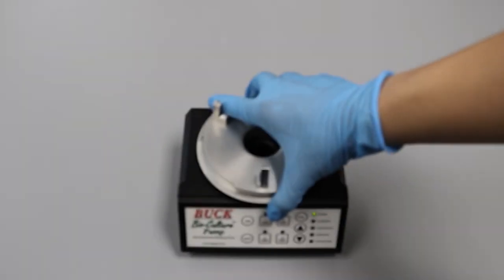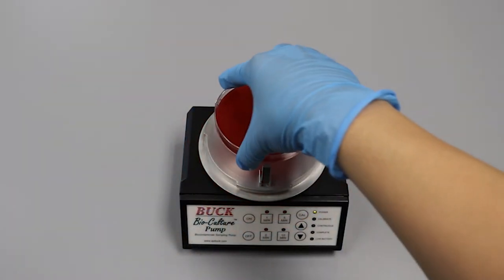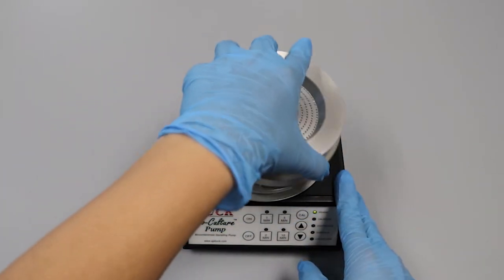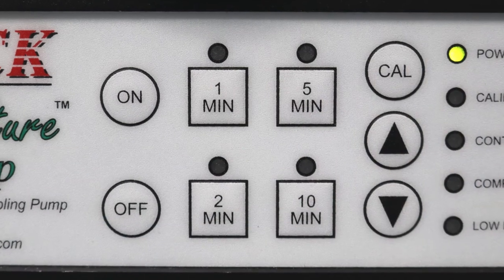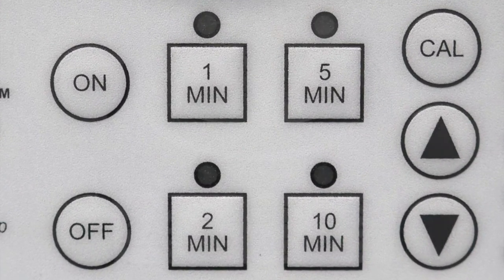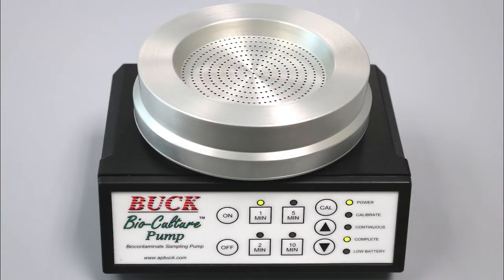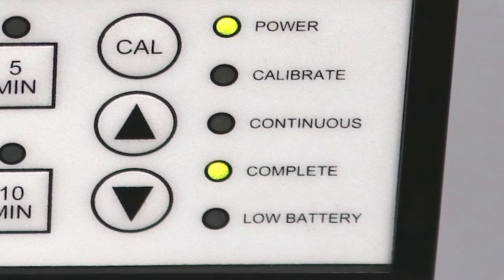Place the pump in the desired location. Open a 90 millimeter agar plate and place the plate within the mount, then screw the sampling head back on. Push the on button, then press one of the 1, 2, 5, or 10 minute keys for automatic timed sampling. At the end of the programmed sampling period, the pump will automatically shut off and the complete LED will be lit.